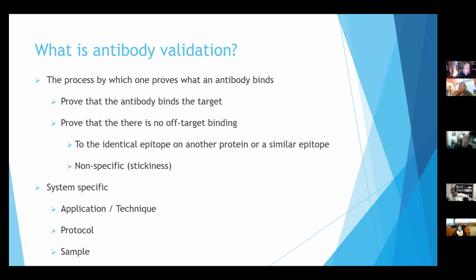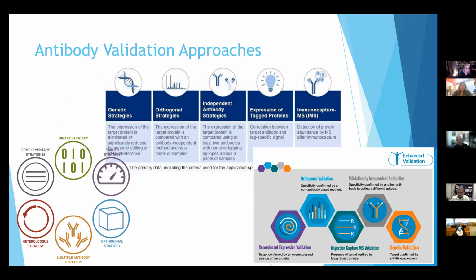These two, because the epitopes that are available are going to be dependent upon how the antigen has been prepared, and the sample usually because what proteins, we'll talk about proteins because they're the most common target, what proteins are available, difference between spleen and muscle, okay, for example, or species maybe.